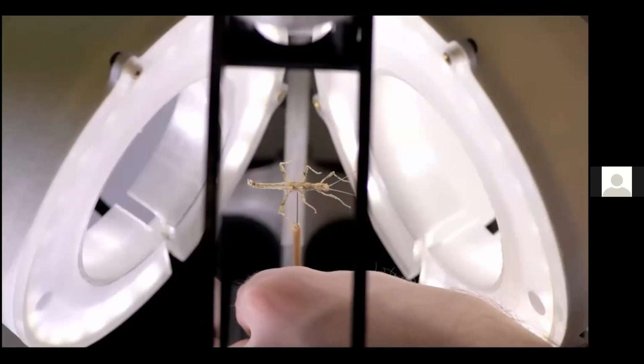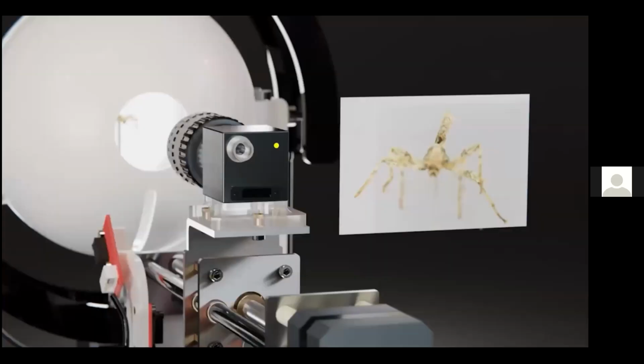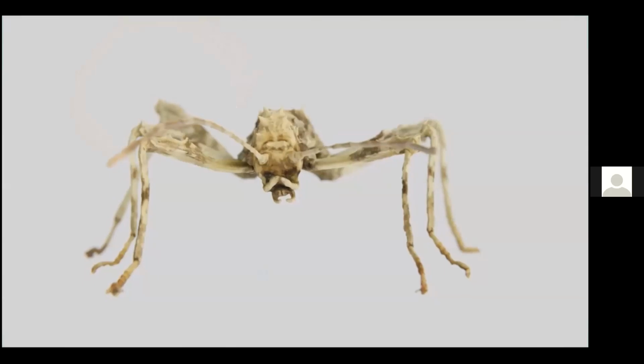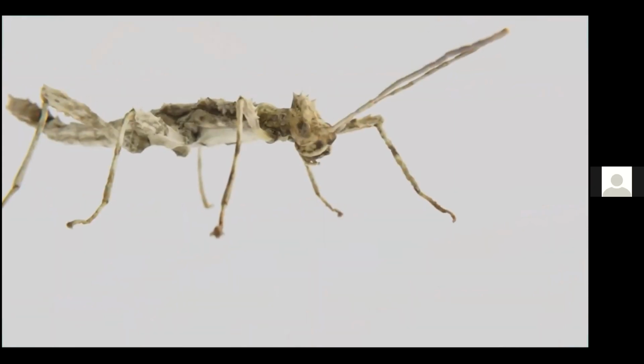And you see here basically a video of the process. You have an insect specimen in a lightning dome. You have a camera rail that takes focus stacked images. And you can then take these images, or you can control the hardware with this graphical user interface. You produce these focus stacks. You can merge them into one EDOF image, and then you can make 3D models from them. And that's the first part of the process. So you can make these textured and color realistic or semi-realistic color realistic models.